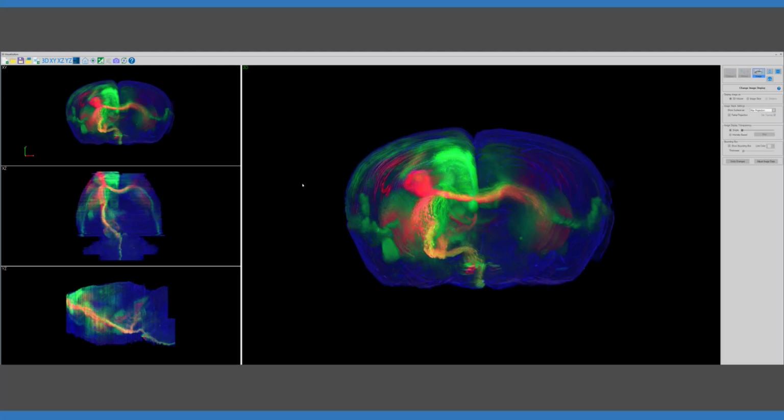This is a 3D volume that's been reconstructed from serial sections. In NeuroInfo, there's the ability to view in 3D. We can see the coronal view, a top-down view, and a side view. I'm going to demonstrate using a brain that came from Nuo Li and Elisa Thomas at Baylor College of Medicine in Houston. They injected AAV antegrade tracers into 2 regions of the ALM frontal cortex, a red tracer and a green tracer.